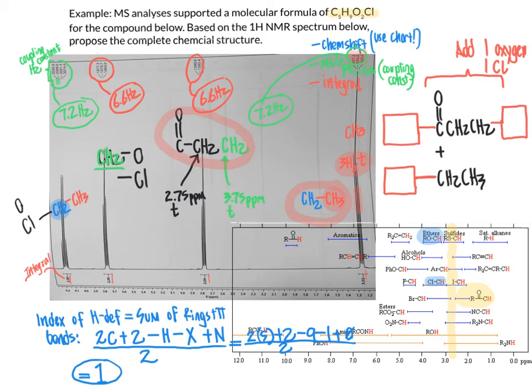So we have 1 oxygen and 1 chlorine left, and we have 3 slots to fill here, here, and here. So one of these has to overlap, meaning that we're going to fill in something here adjacent to the CH2, CH3, and then that's going to be the same atom that stitches us into the other system. So thinking about the 2 possible ways to do this, we could either place an oxygen atom here and a chlorine over here, or by process of elimination, chlorine could go here and oxygen could come over to here.